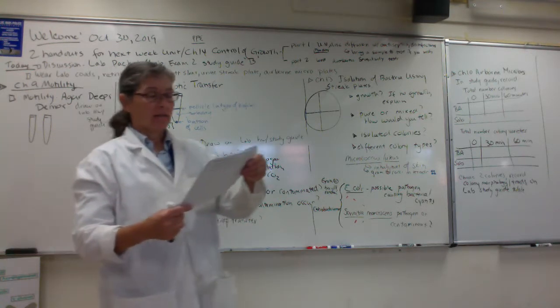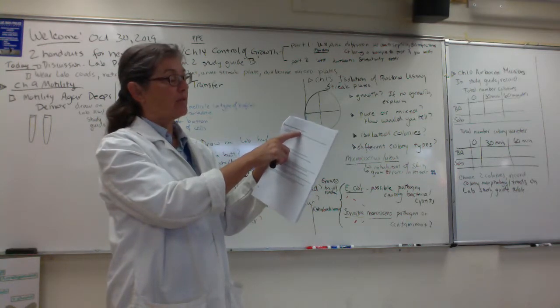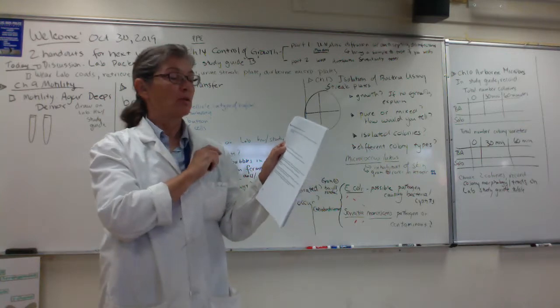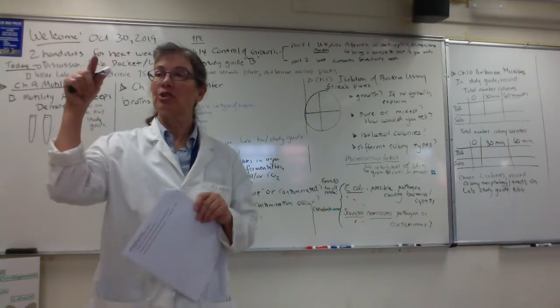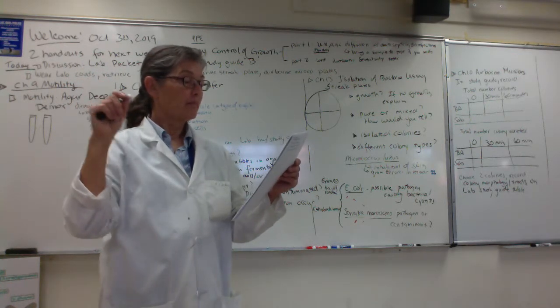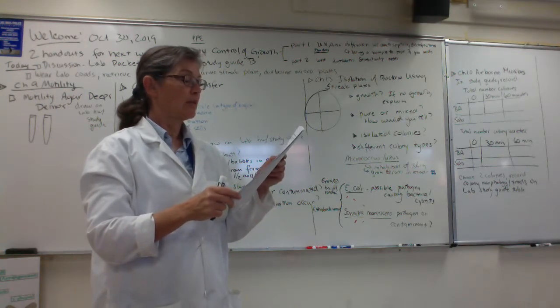Okay, let's see here. Again, we're on aseptic technique and transfers and chapter 13 isolation. So folks, how can you determine if microbes are growing in a liquid culture? The turbidity, right? And also we're going to check for a button, right? Okay, good. And then, folks, number 3 is to describe the steps within aseptic transfer.